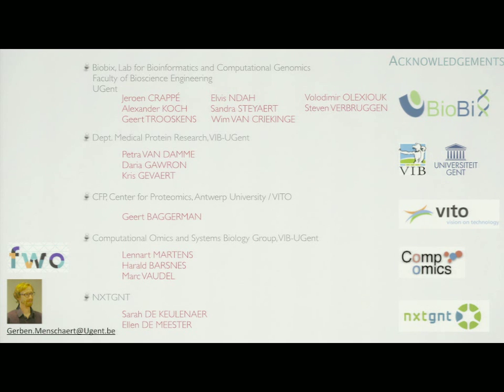I have a related question. When you're talking about these near-cognate codons, in the genome and in the RNA you don't have the conventional ATG, and all the protein databases are driven off of that. So when you are doing proteomic search, are you basically forcing it and converting those other amino acids into methionines? Yes. Is that the trick? Because all the other people out there, if they don't do that, they're going to miss all of those. So in other words, it might already be out there in existing data sets, but we are under-identifying them, subject to all of the caveats we have. Correct.